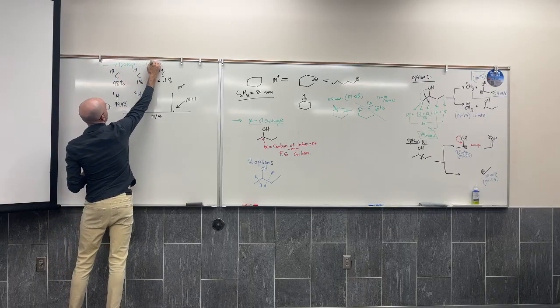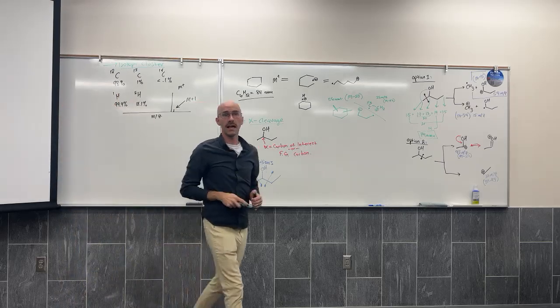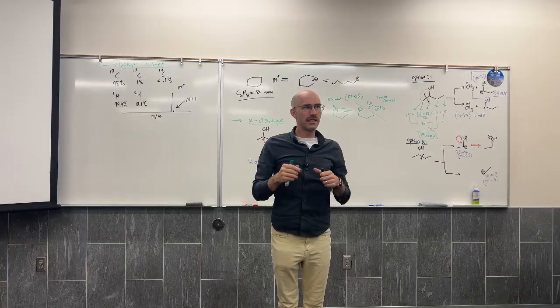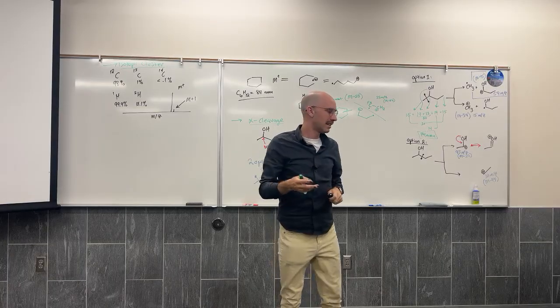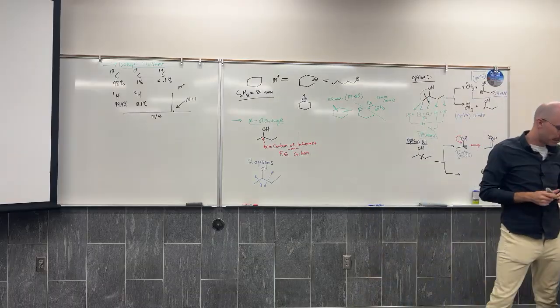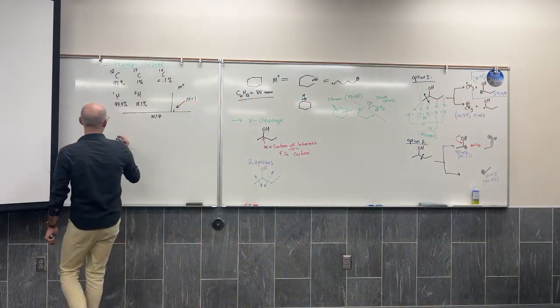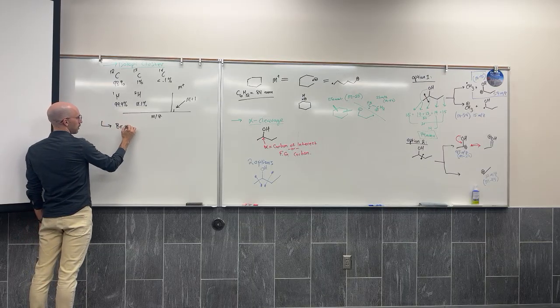Now, you guys, I think, can see that the isotopic clusters that result from carbon and hydrogen isotopes are unreliable at best. It's not like a consistent size at the M+1. It's a bit random. But bromine and chlorine give very consistent isotopic clusters.